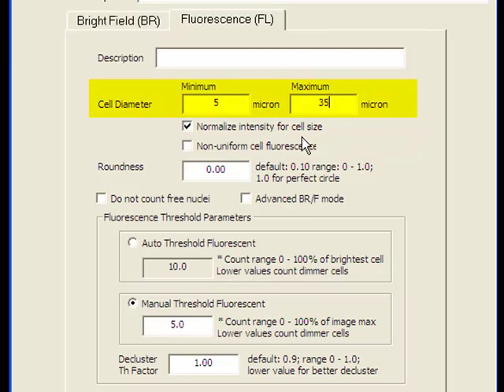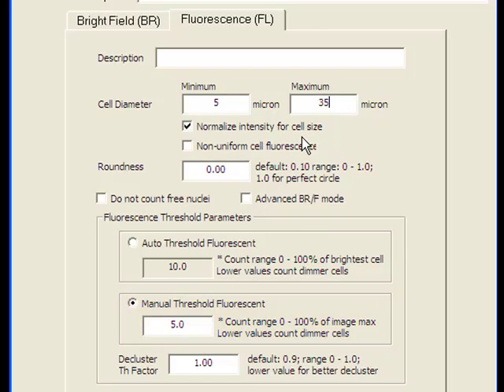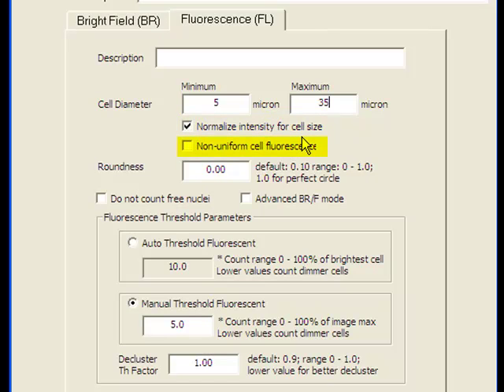Manual threshold fluorescent is the most used threshold method. Normalized intensity for cell size method calculates the total fluorescent intensity divided by cell size. Non-uniform cell fluorescent is used to measure cells with weak or spotty fluorescence.